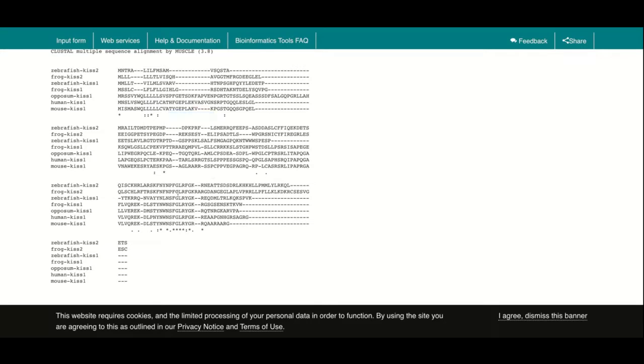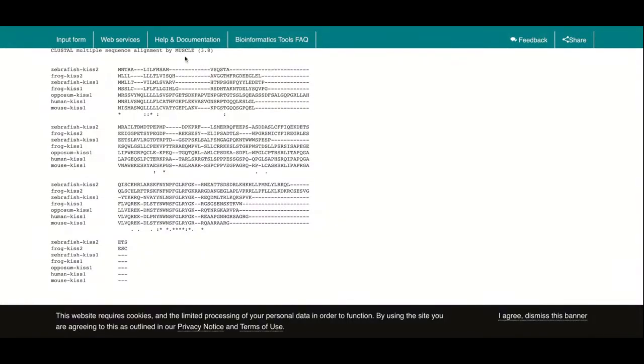All right, so this one has this many stars or symbols, and we could count them, but you could just have both alignments side by side. I wanted to do that, but I can only show you one tab at a time with the permissions I have set on this computer. So, okay, that's Clustal. Then I'm going to quickly switch, or wait, sorry, this is muscle, and it also says right there. I'm going to switch to Clustal so that you see which one seems to have worked better.